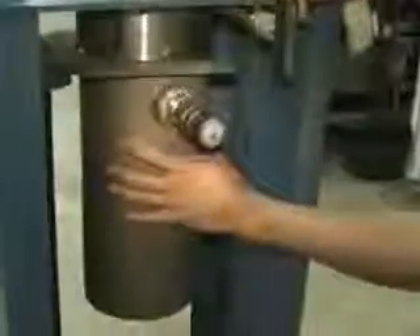Now we're going to have it in the up position so you can see it there. We're going to demonstrate the Zipperclave in its top position. Again, you have your jacketed reactor here.